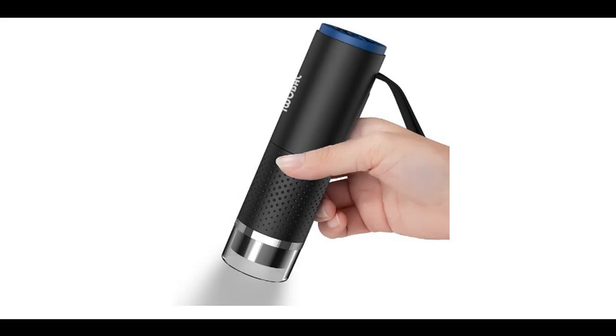Features highlight: fixed magnification 50x plus zoom magnification can satisfy your normal needs. Note that this microscope is not suitable for professional or serious biologists.